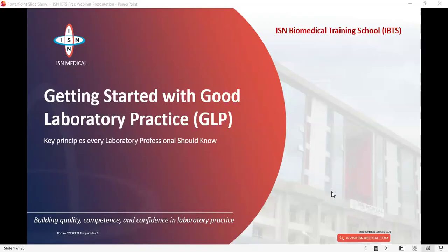So that is talking about the pre-analytical stage of analysis in the lab, right? So that can actually affect your results. Thank you very much. That's the correct answer. Does anyone have any contrary opinion?